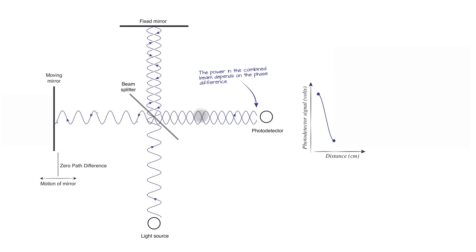It resulted in, now at this point, the light is completely out of phase. It's canceling itself out at every single step as it reaches the photodetector. And look what happened here. We're now at a minimum of power. If I move the mirror another little bit, and I change the path length by, in total, a complete wavelength, now I have gone through a minimum at half a wavelength of distance change and back to the maximum at a full wavelength of distance change.